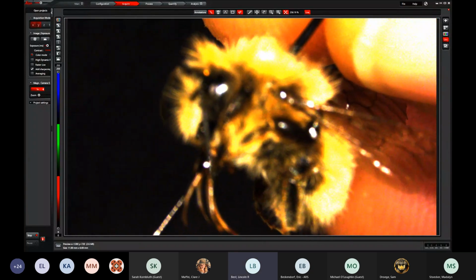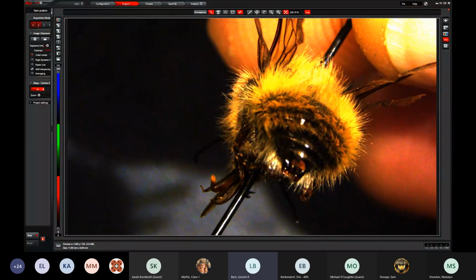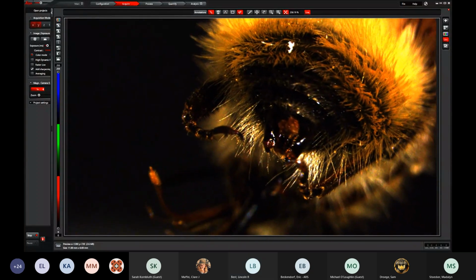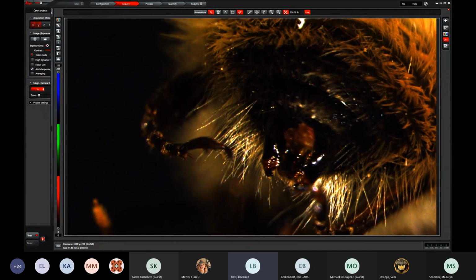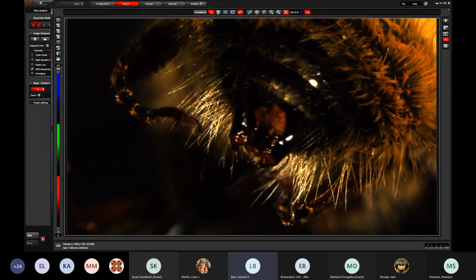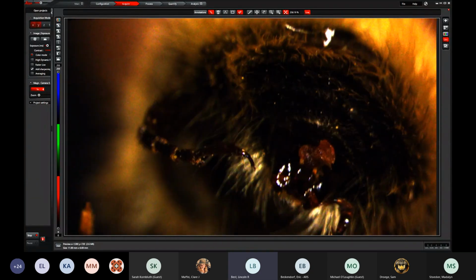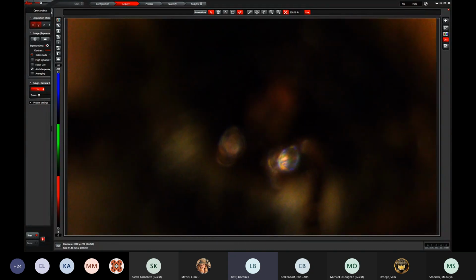This is a specimen that's been humidified for about 15 hours. You can see that the genital capsule is already, I'll zoom in a little bit, partly exposed. In fact, it's probably sufficiently exposed to get an ID on it. You can see the gonocoxites, that simple triangular volsella. I'll zoom in a little bit more and we'll get a good look at those inwardly hooked penis valves.